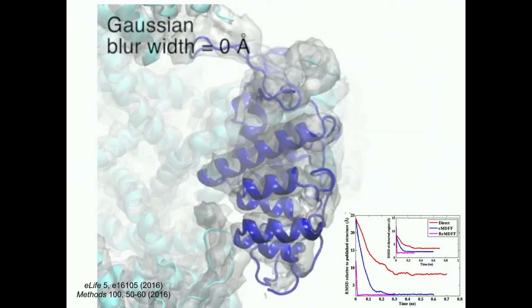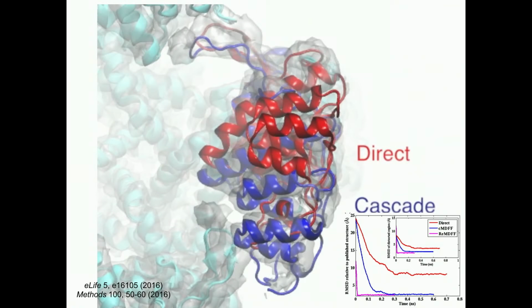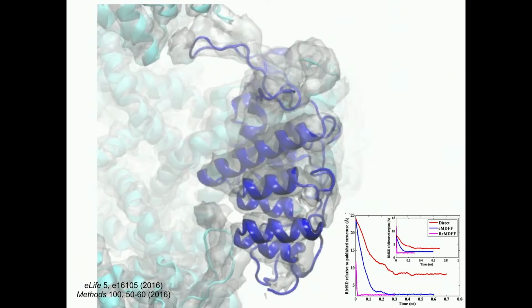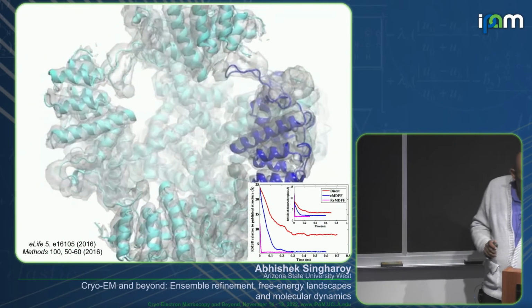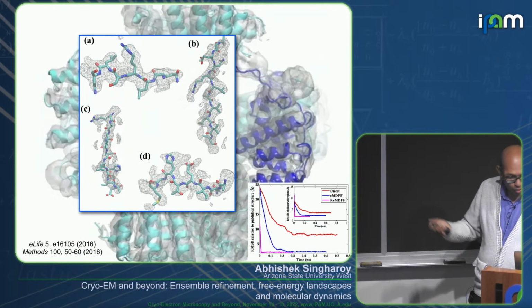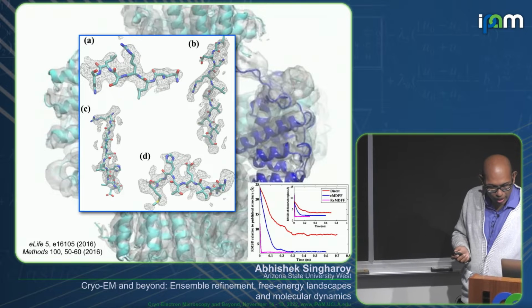There was a replica exchange association with that, where you don't just go in one direction in the density. You can go back and forth between high resolution and low resolution till you fix this problem. This problem had been duly addressed 5 years back. With that, of course, both backbones and side chains are well in place.